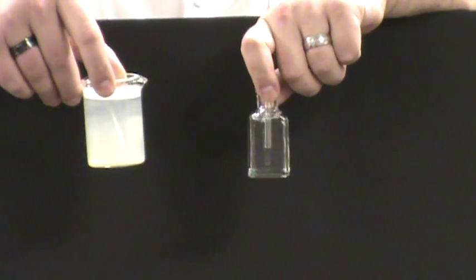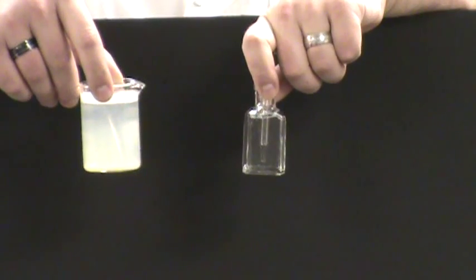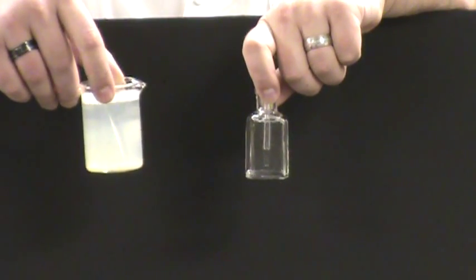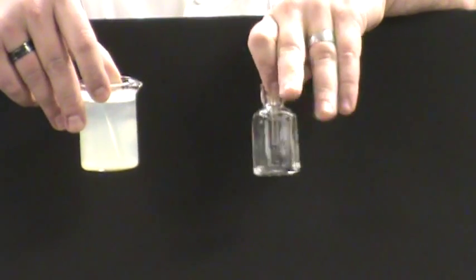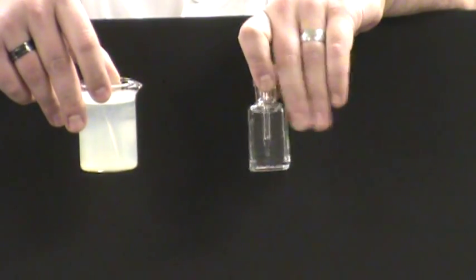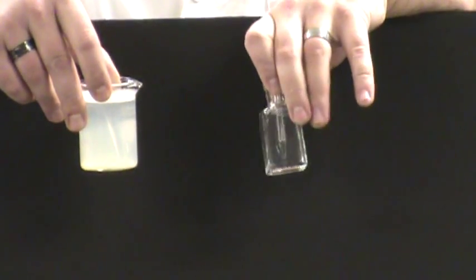When you're describing the color of a solution, you need to use color terms. This one is white. This one doesn't have any color. So this is a colorless solution.